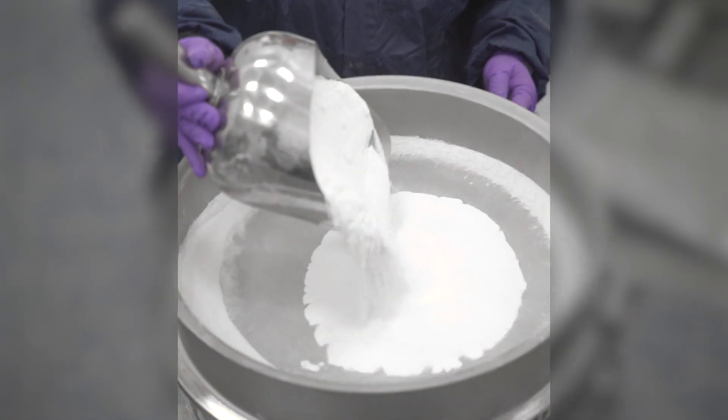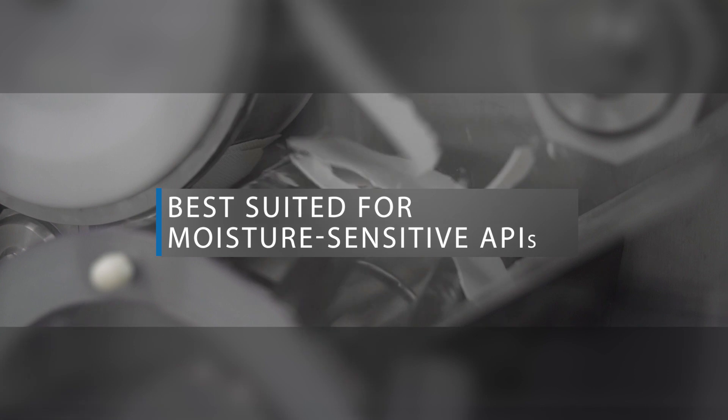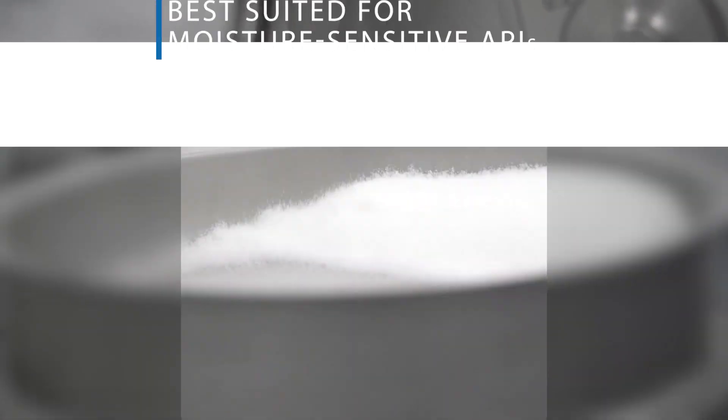Roller compaction is a dry granulation process for materials that are sensitive to heat and moisture. Unlike wet granulation processes, it does not require liquid binders, alcohol solvents, and high temperature drying, resulting in a more consistent, higher quality granule.